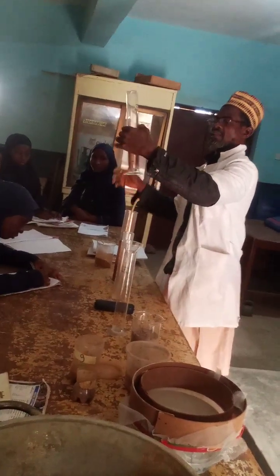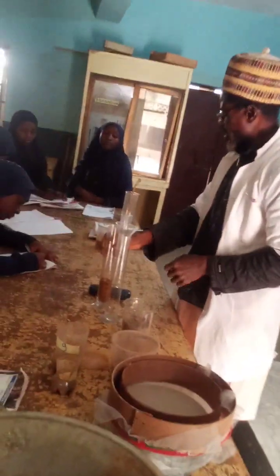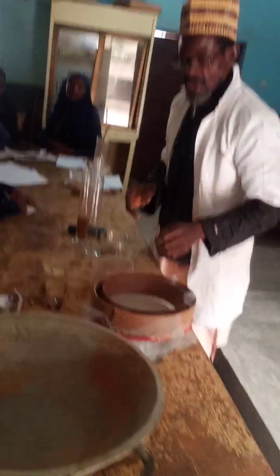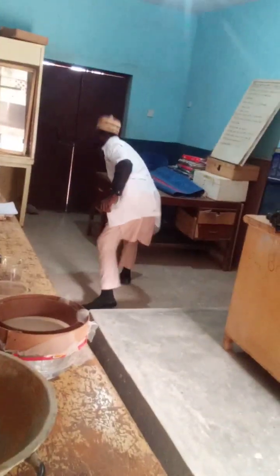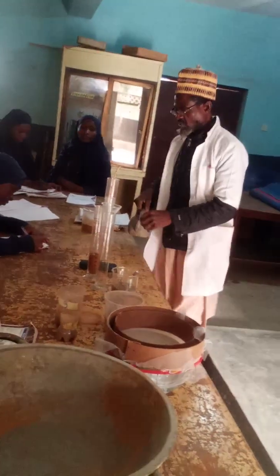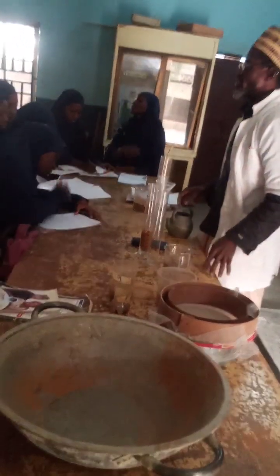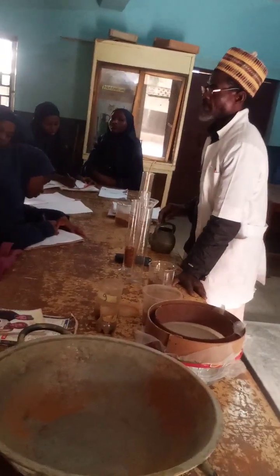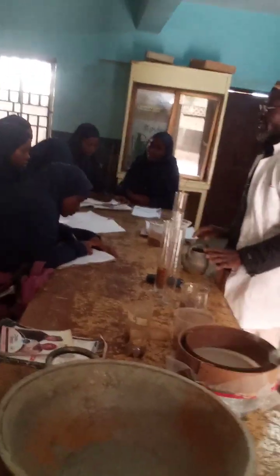So we are pouring it. Then the next thing you are going to do is to add some quantities of water with a solution of hydrogen peroxide.